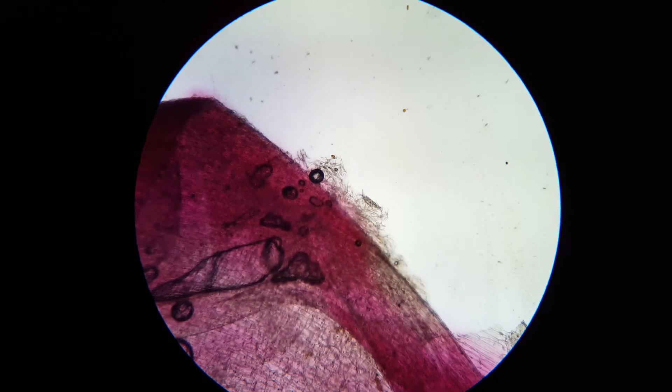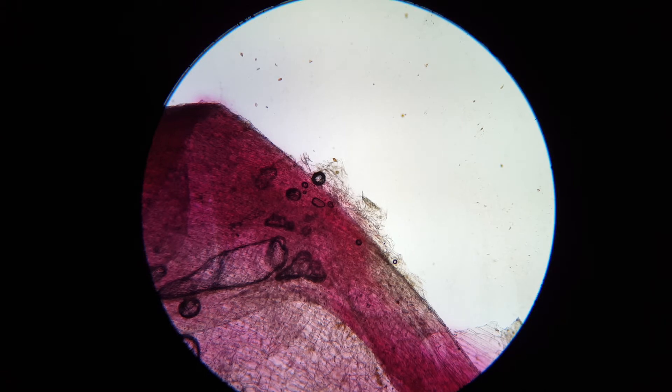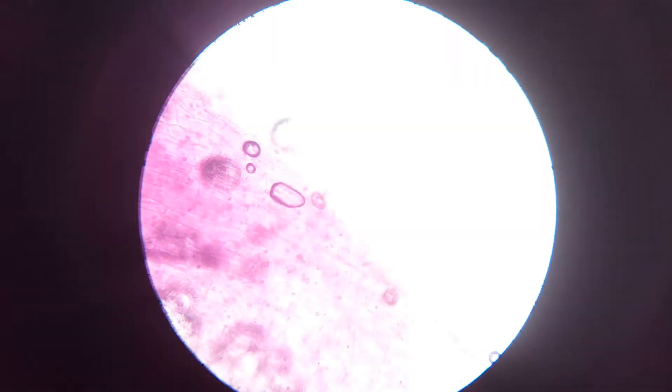I've got the mechanical stage up as high as it goes. I'm using the coarse focus adjustment to get this into focus. We are looking at it under the 4x objective, switching over to the 10x objective.